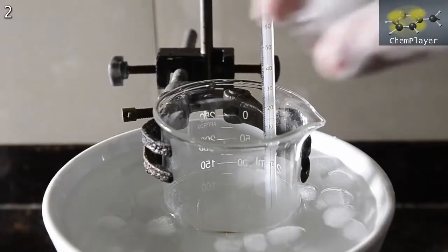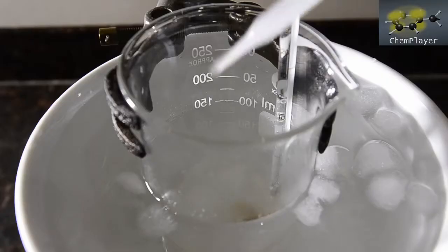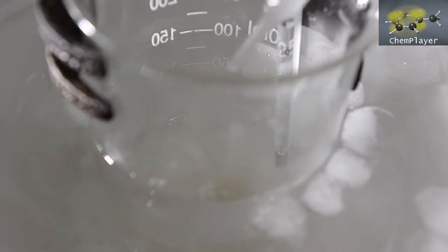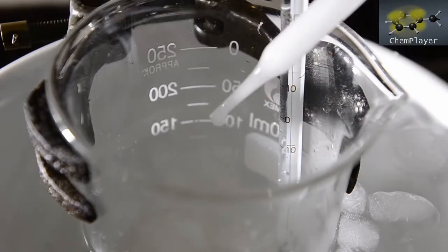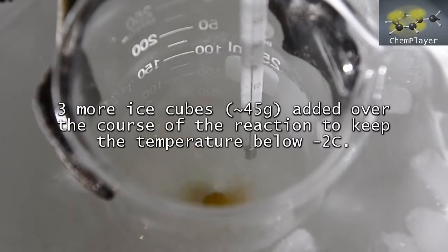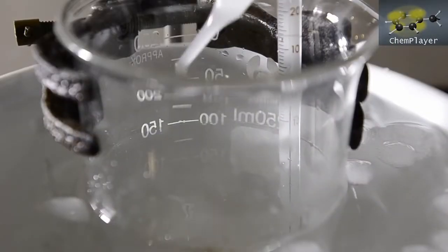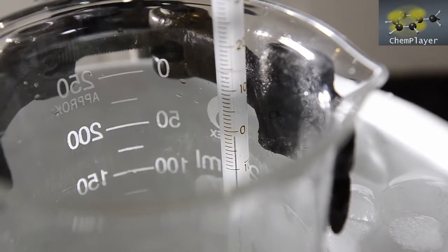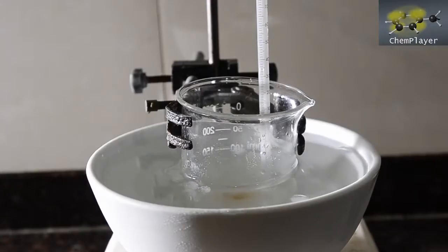And we started off with 2 ice cubes. Starting temperature at -10 degrees, and this time we added slowly dropwise. During the first half of the reaction the temperature was at around -5. We added a total of 3 more ice cubes to keep the temperature down. The large extra cold ice bath helped a lot. Towards the end the temperature rose to about -2. And after about 30 minutes we're done.